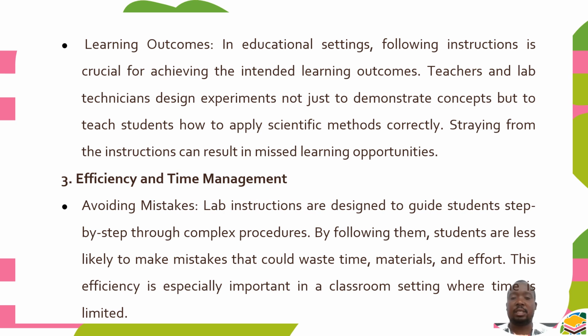And again, efficiency and time management. If you follow laboratory safety rules, you avoid mistakes. So lab instructions are designed to guide students step by step through complex procedures. By following them, students are less likely to make mistakes that could waste time, materials, and effort. This efficiency is especially important in a classroom setting where time is limited.